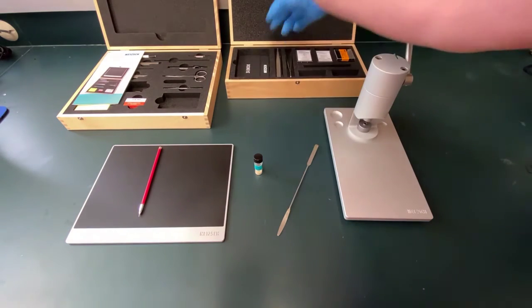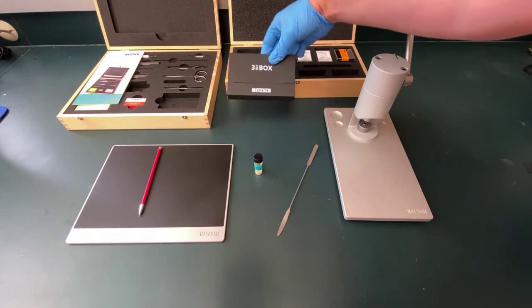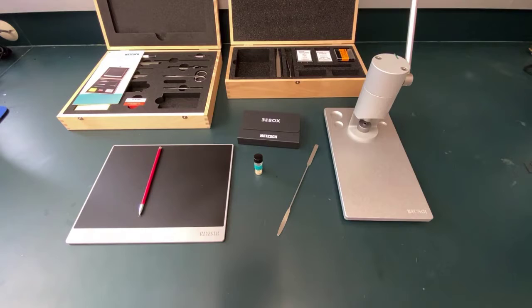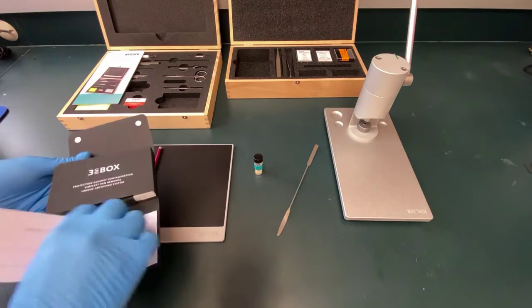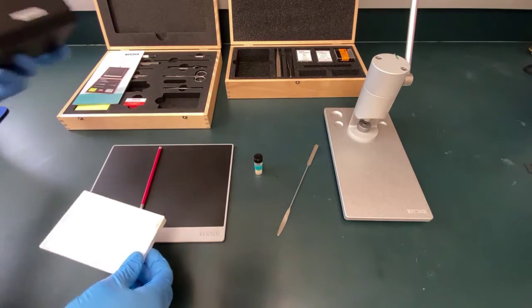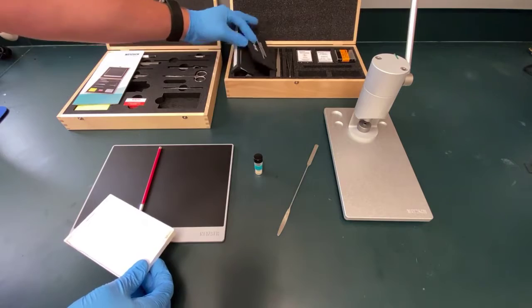And then for now, the crucibles, or the little aluminum pans, live in this box, although by the time you watch this video, maybe we've moved on to buying cheaper ones. These are the expensive ones that come with the instrument. So we just got the instrument when I'm recording this video, so we still have a full box of the nice expensive ones, until I break the box.